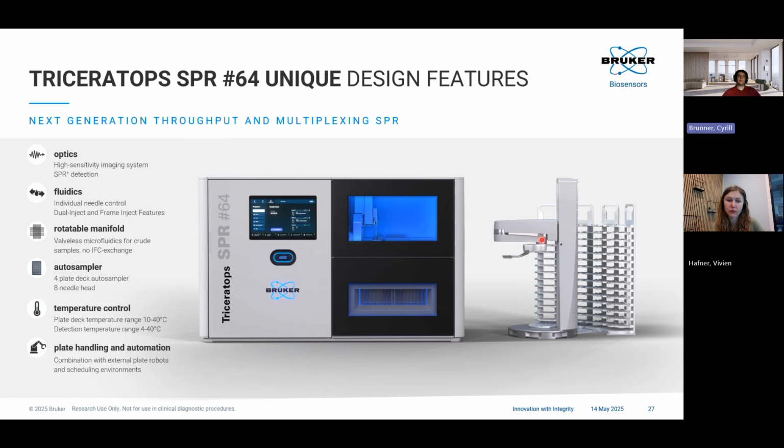If you go for a pseudo-covalent capture-based approach, meaning biotin-streptavidin interaction, as an example, or SPY tag is another possibility, there's typically not so much to consider. The assay works pretty much identical as for an amine coupling. If you go for other capture-based approaches, such as Fc capture or His-tag capture, there you have to take a few things into consideration.